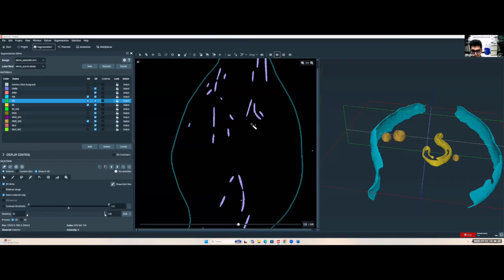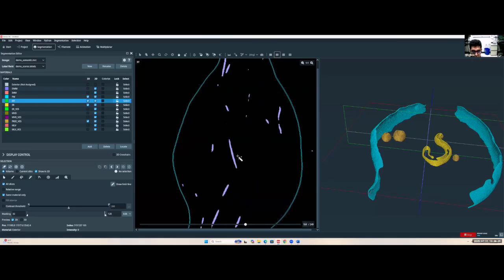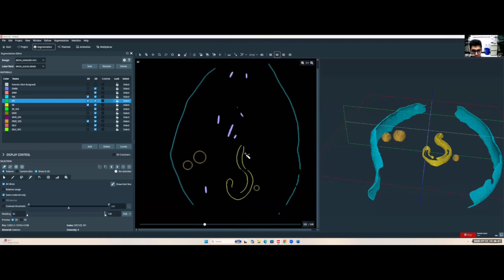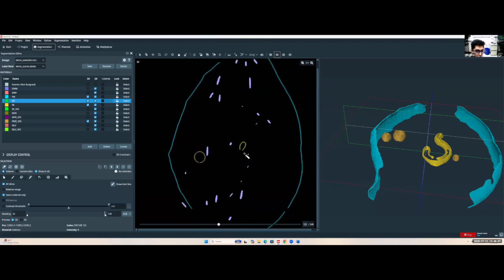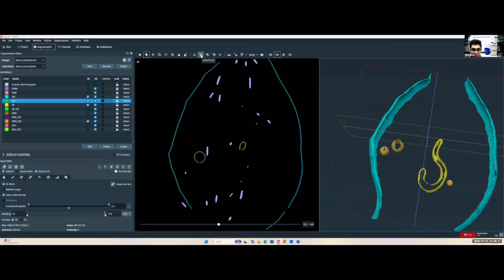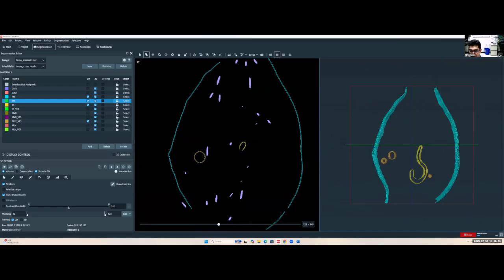The plasma membrane stays, and any segmentations we previously had will stay. It'll show their outline. If I scroll through some of the Z slices, maybe we'll see that ER that we segmented. So here are the vesicles, and here's the ER that we segmented. And you'll notice that the masking has already automatically adjusted itself. So my microtubules, I want to segment using TARDIS. In the 3D viewer, nothing happens. I want to return to my XY view rather than coming around, so I can hit this XY button at the top, and boom. Now, let's start segmenting our microtubules.